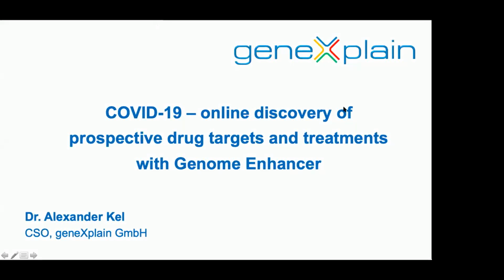Our topic today. We'll talk about the COVID infection, of course, and we'll try to analyze gene expression and proteomics expression data in order to try to find targets, drug targets, and possible treatments. And we'll use a tool called Genome Enhancer, and I will introduce you a little bit to that.